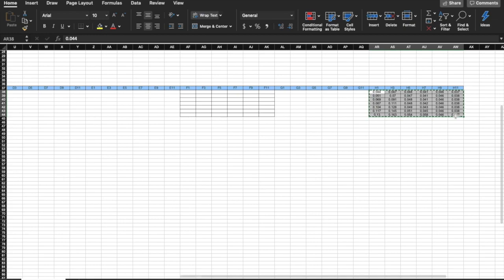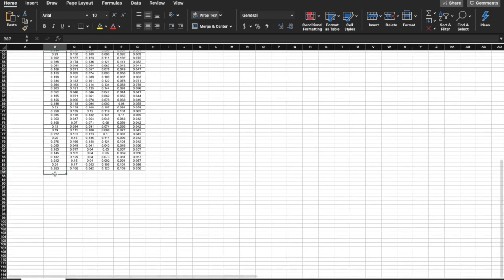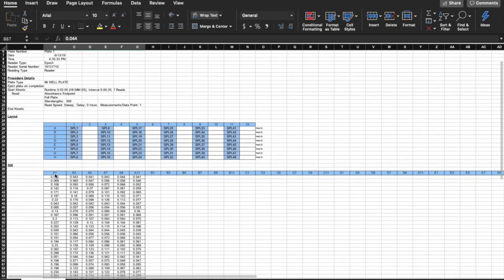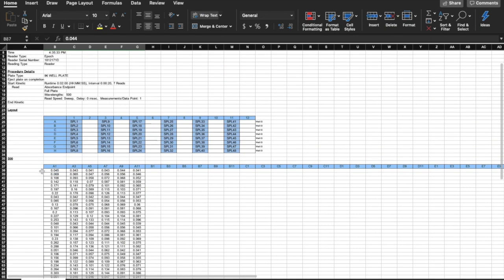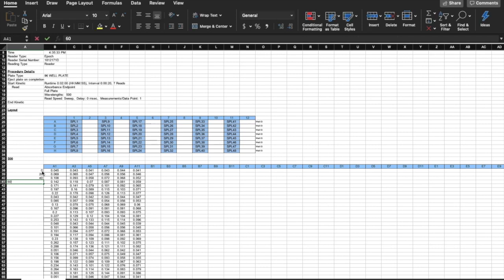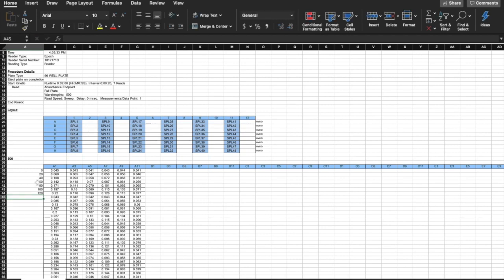Next, I am manually putting in the time, starting from 0 then adding 20 seconds until 120 seconds because the plate reads it every 20 seconds for 2 minutes. Copy and paste for the rest of the column.